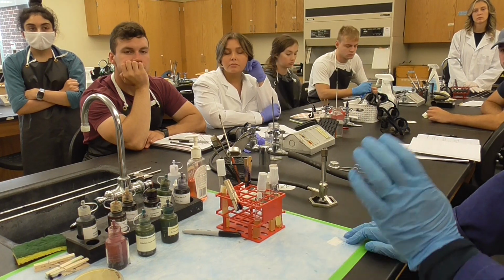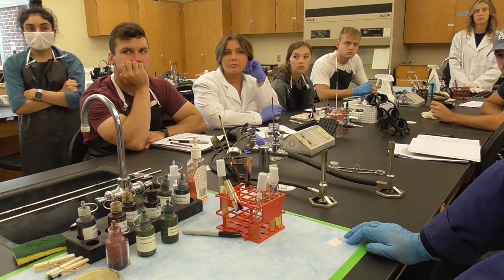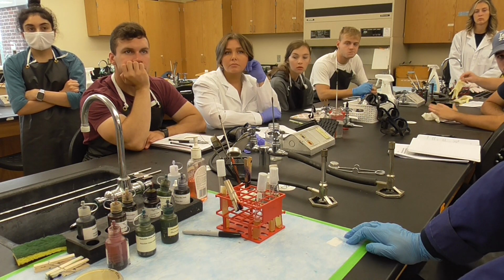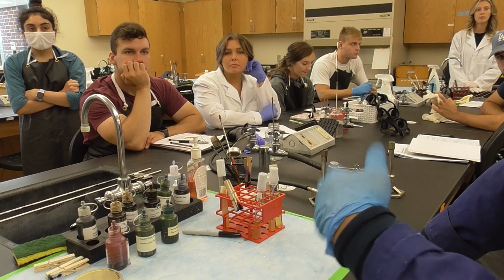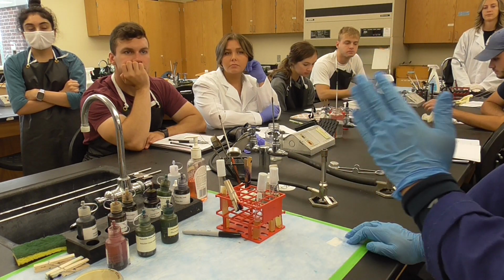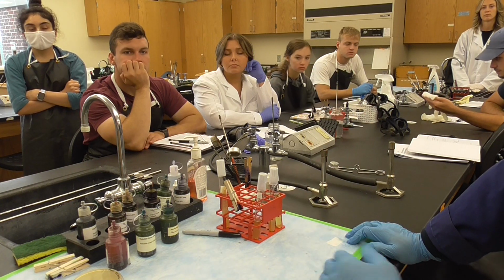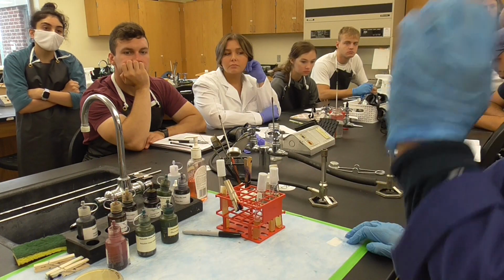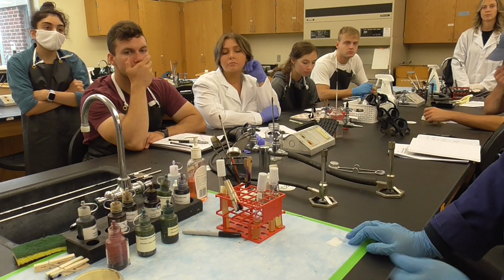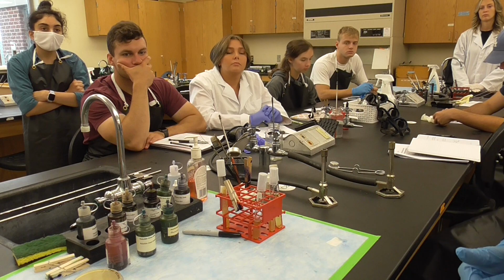On Thursday, you should see a beautiful red colony. And the 35C is basically for growing E. coli. Then you will see the difference. And then you pick the colony from there to do the gram stain. You're going to figure out what's the difference between them. Maybe looks similar, maybe looks different. And maybe you also could get some contamination. It all depends. But it's a good practice for you, okay?